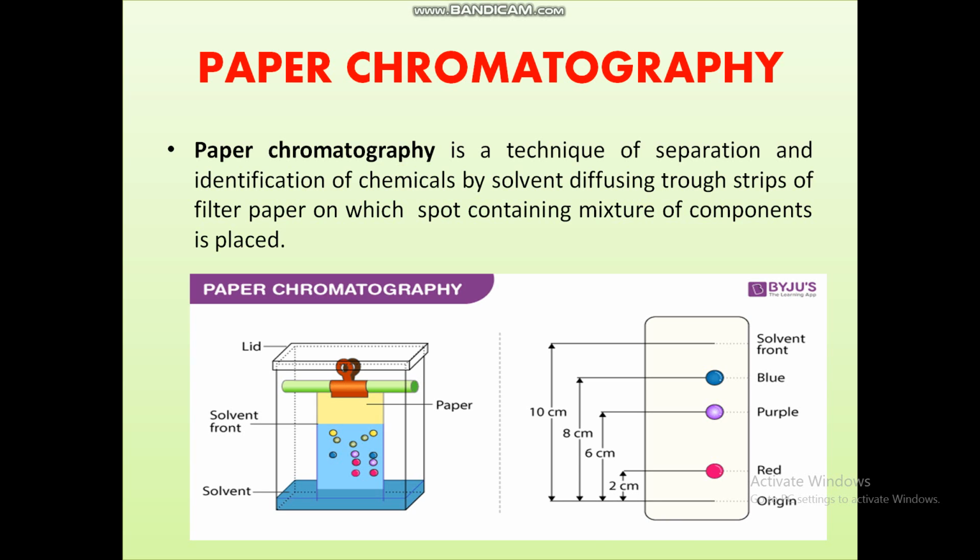Hello dear students, today we are going to study one more chromatographic technique, paper chromatography. In the last video we studied thin layer chromatography. Thin layer chromatography and paper chromatography are the same.